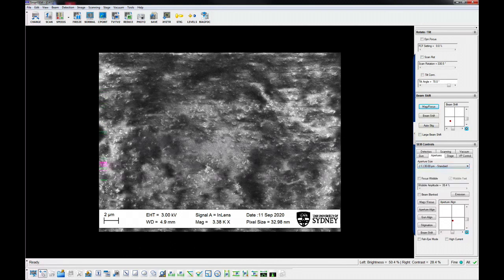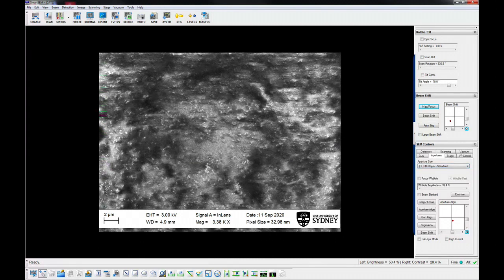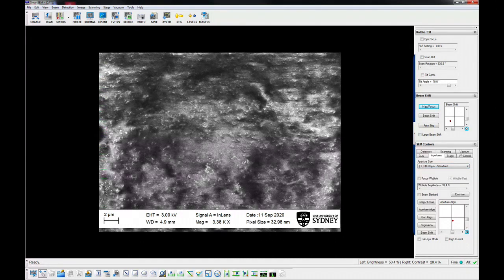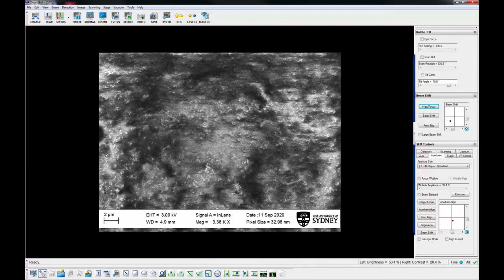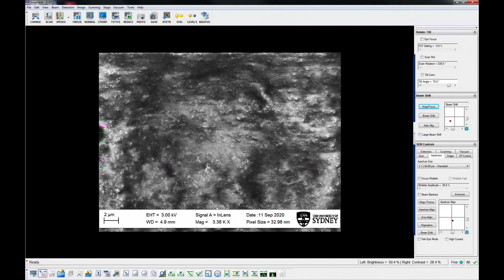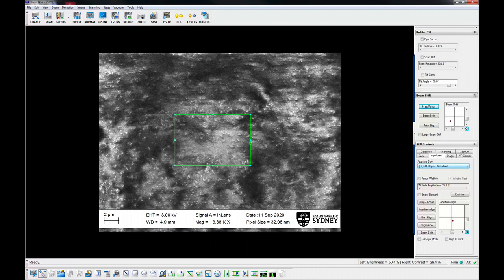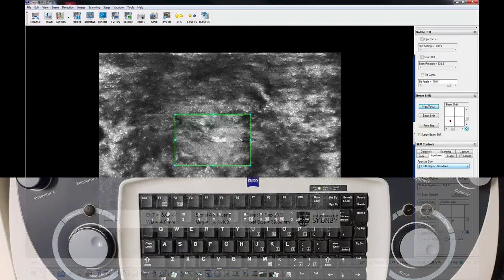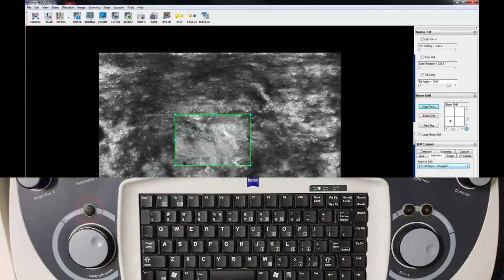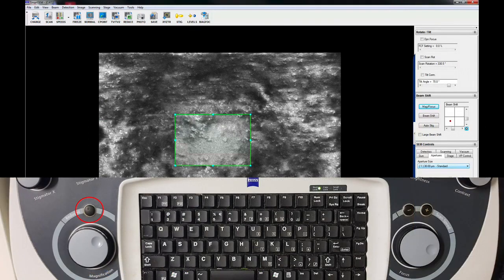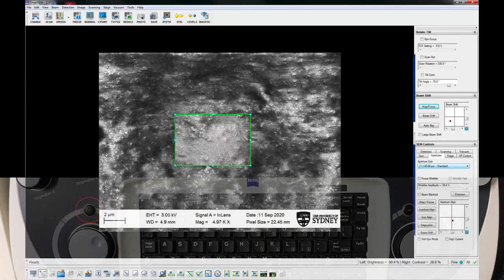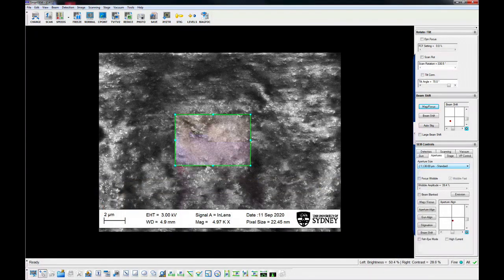Focus and stigmate the specimen at a suitable magnification, for example, 5,000 to 50,000 times. You may find it easier to reduce the scanning area using the reduced area window and slowing down the scan speed to gain a better signal.